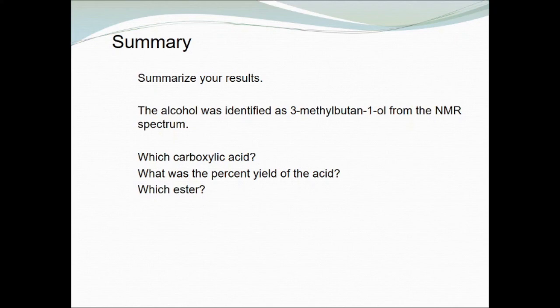The NMR can sometimes be a little difficult to interpret. Since there is so much information, it is more complex than interpreting an infrared spectrum, but at the same time it gives a lot more information. So it's a good idea not to wait until the last minute to try to write your report, so that if you do have any questions or difficulties, you have time to ask your instructor for assistance and give your instructor time to get back to you. So don't put this off. Start it early.